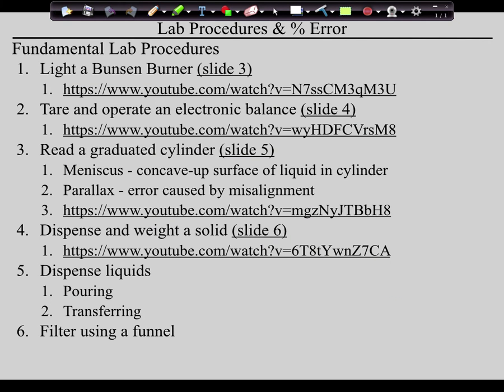Okay, so guys, that's how you light a Bunsen burner. Now, I know that some of that terminology was new to you. So what I want to do is talk you through this so that you see how this works and you understand the parts. So guys, with a Bunsen burner, there's a hose that obviously plugs into the tap that's on the tabletop.